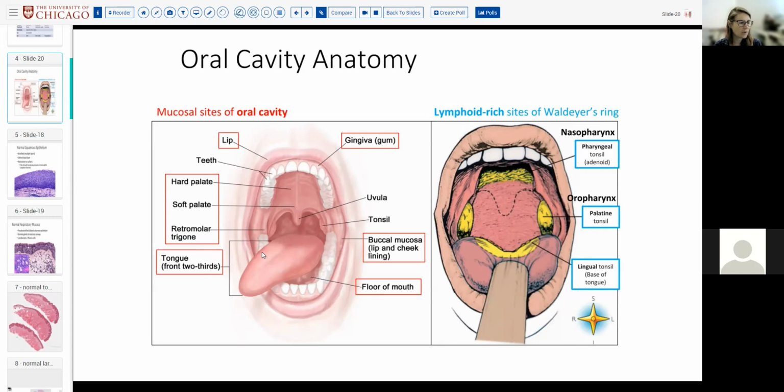Okay. Moving up and around, we have our palate, right? So we have the hard palate, which progresses to the soft palate, which of course progresses to the uvula, the tonsils being on either side between the palatoglossal and palatopharyngeal folds. So for example, if you have your teeth closed, depending on whether you are in a space that is inside the teeth or outside the teeth, let's think about how those areas are named differently.